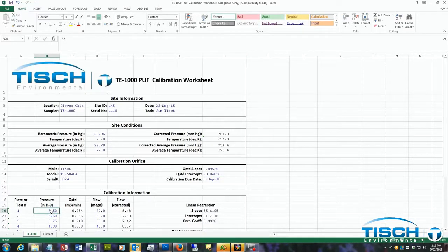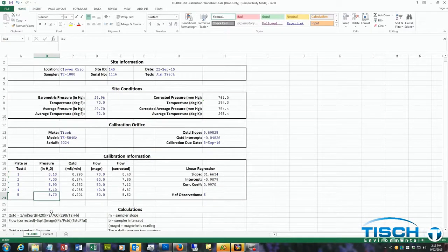Next is the calibration information. In our example, the first point at 70 was 8.1 inches, the second point was 7.0 inches at 60, 5.9 inches at 50, 5.1 at 40, and 4.2 inches at 30.